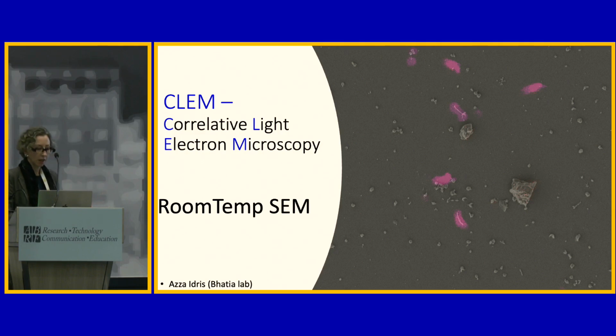And so in this case, they were looking at which sporozoites had interacted with different fluorescent antibodies. And so, again, this is a sample that's dry, it's at room temperature, but the next step was to then say, okay, what does this really look like when it's still hydrated in its native form?